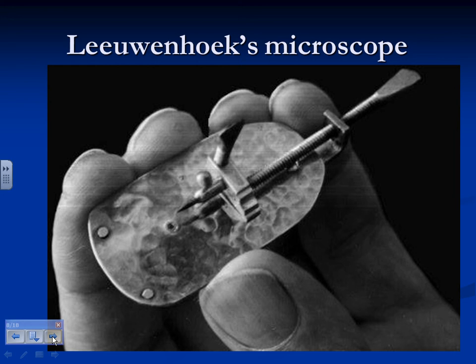All right. So there's a human hand. This thing is probably only about an inch and a half big. How are you supposed to look through that? Okay, maybe about 6 centimeters or so. He must have had 20/20 vision. Now, here's what's weird. Where is the lens? The thing is the lens. Not the whole thing. It's that little hole right there.